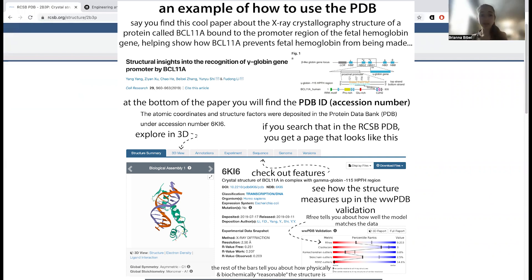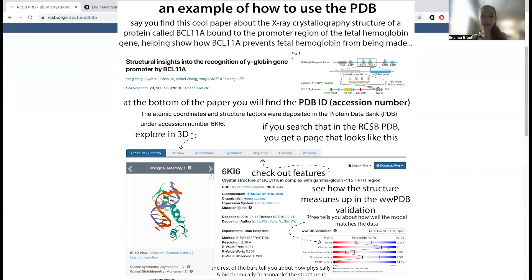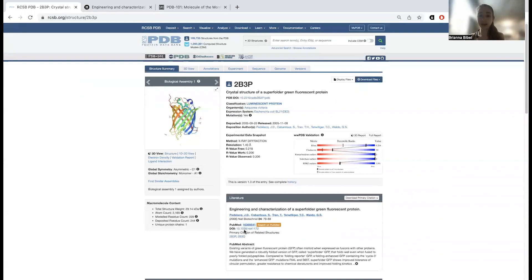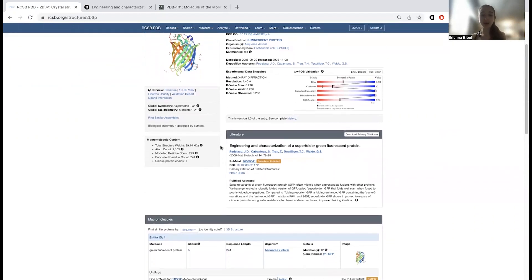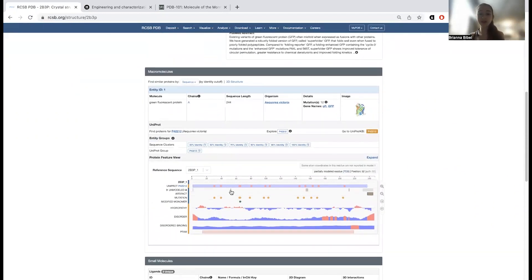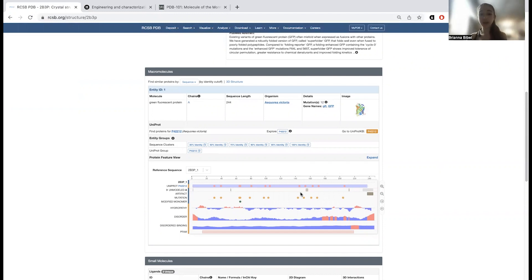There are a couple of things to point out in the PDB entry. We can see that overall this is a 1.4 angstrom resolution structure, which is really high resolution. However, there are also going to be regions with a high B-factor, and regions that are actually unmodeled or partially modeled — basically regions where the signal wasn't strong enough to determine where the side chains were, and at the ends you can't even model at all because there isn't enough density.